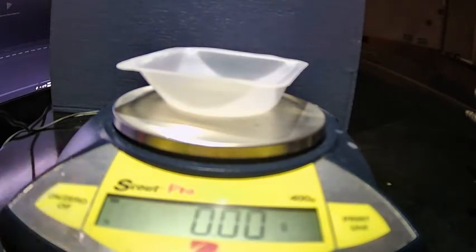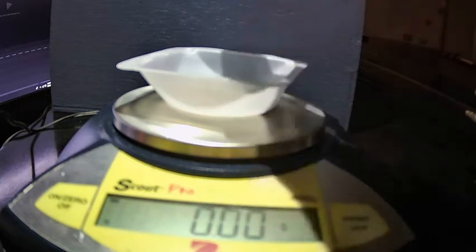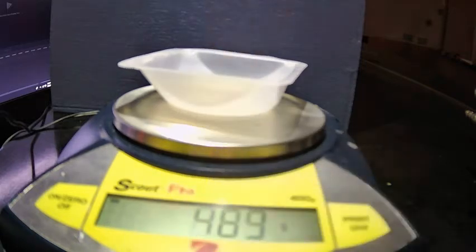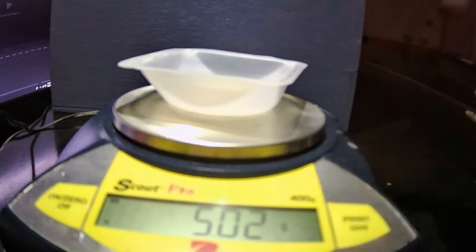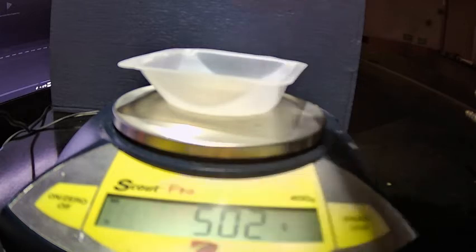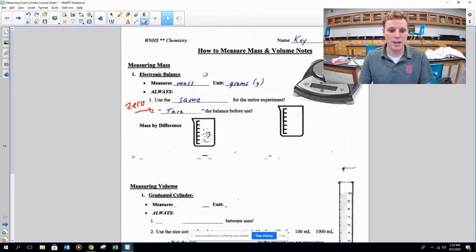The moment you walk up to a balance, the first thing you should do is hit that zero or tare button so it reads zero. We're essentially telling the balance: whatever you currently have on you doesn't count toward the mass — I only want to count what I add now. So when you add your substance, you know for sure — for example, 5.02 grams — and it does not include the dish or anything else.